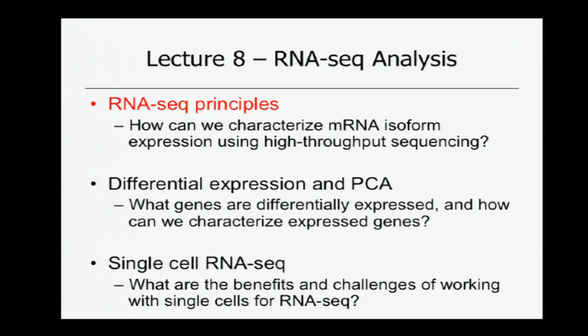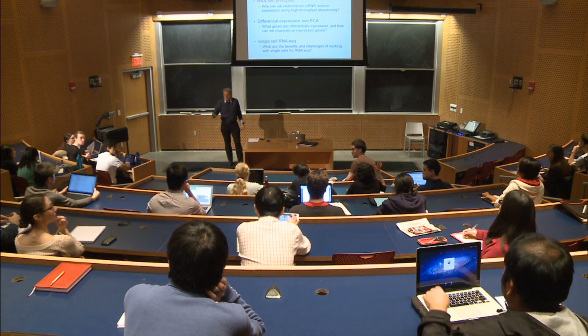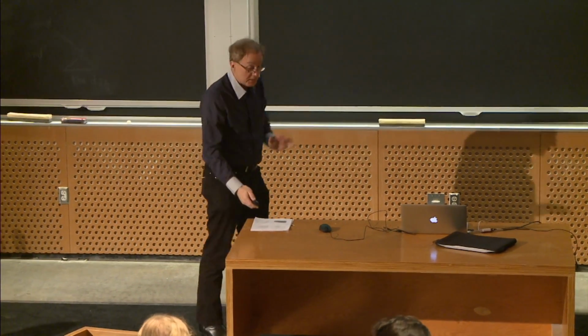So first, let's talk about RNA-seq. How many people have heard of RNA-seq before? Fantastic. How many people have done it before? Some? Great. So RNA-seq is fairly simple in concept.